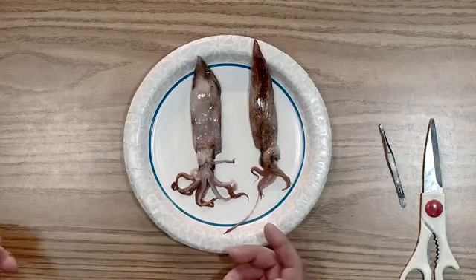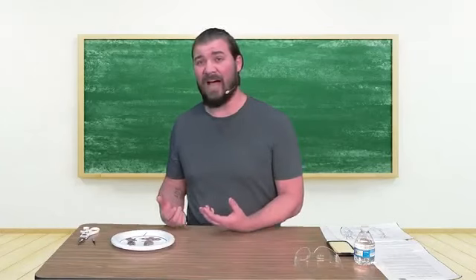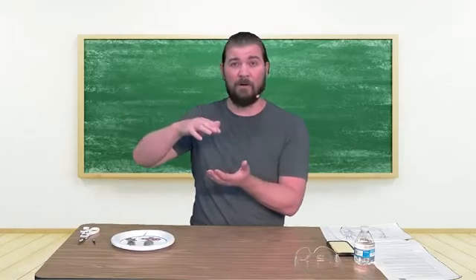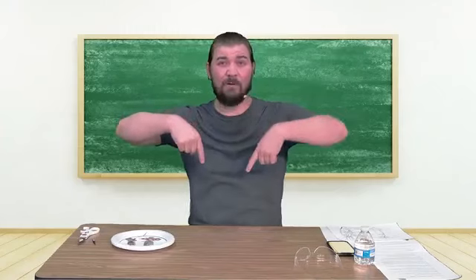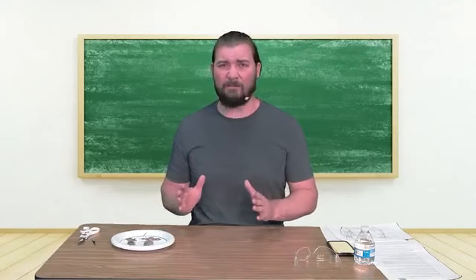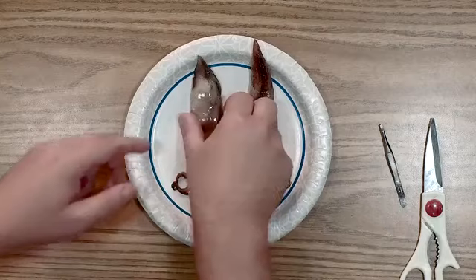This is a natural thing that a lot of creatures in the sea have developed to help them survive. This is called counter shading, and that's when the top part is a different color than the bottom part. So one of them is camouflaging for things that are looking down, and the other part of the organism is camouflage for things that are looking up at it. So awesome natural defense.